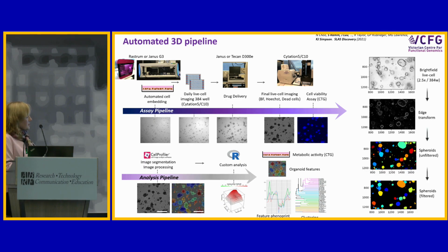So you can see on the top here that bright field images with organoids are still pretty ugly and very diverse. That heterogeneity in tumours is real. If you ever see one image that it's just beautiful and round and every one of them looks like that, it'll be a cell line of some sort. It's not like that in patient data.